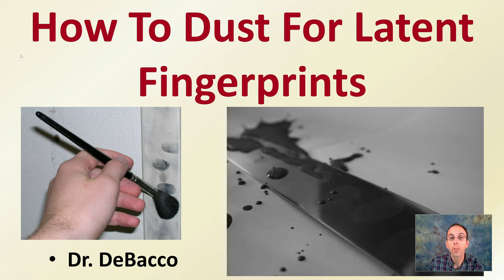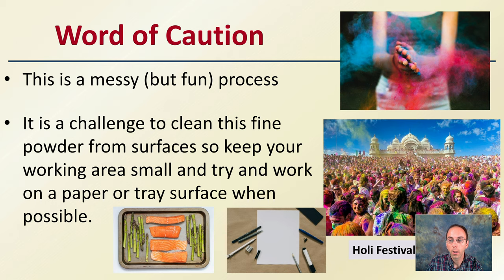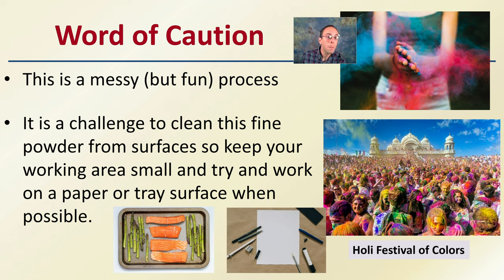Here I'm going to outline how you would dust for latent fingerprints. Keep in mind, latent prints are ones you can't initially visually see. A word of caution when going through this process: it can be messy, but also a fun process. It's a challenge to clean this very fine powder because it needs to get into all those little porous surfaces, so if you get it in areas you don't want, it's very hard to clean. You want to keep your working area small and try to work on paper or a tray surface when possible to make cleanup easier. We don't want it looking like the Holi Festival of Colors when working with these powders.